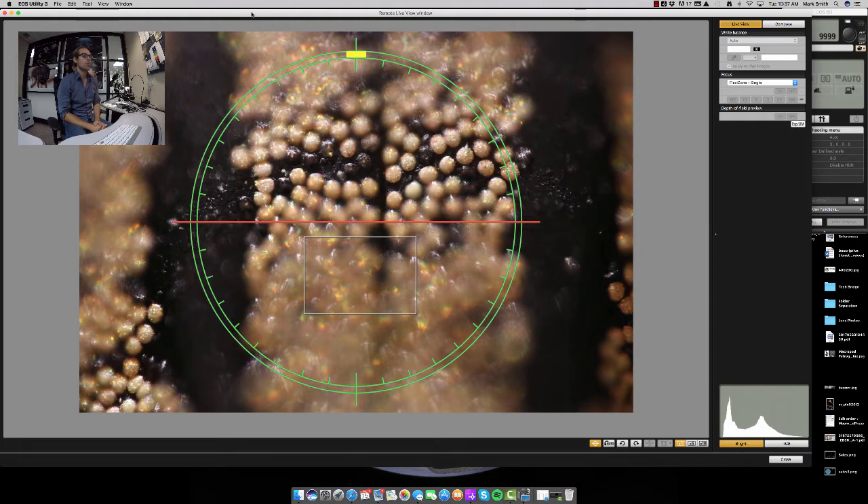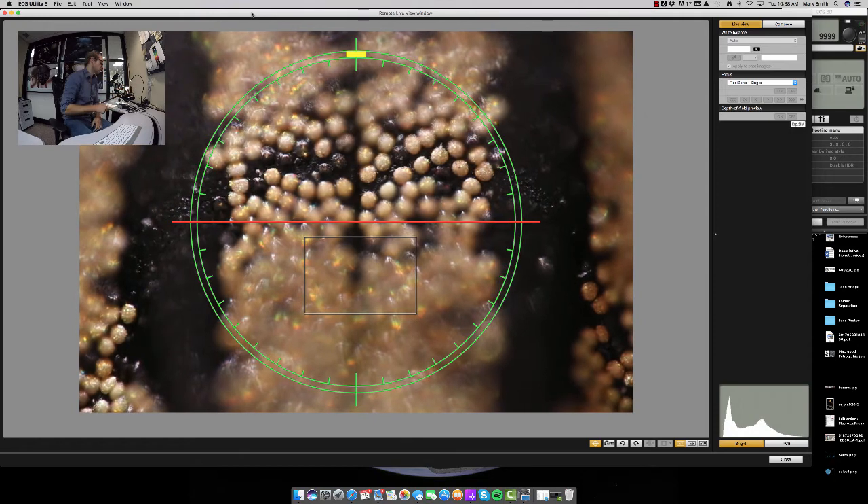In this example, we're only looking at a smaller section — we're not looking further down the body. So typically, if I were imaging the wing of a butterfly and I was using 20x as opposed to 10x, the depth isn't going to change all that much, so I would take twice as many photographs using the 20x objective. Typically, because this was an extra long specimen, 135 images was appropriate with the 10x, but normally I would take somewhere close to 85 images. So now that we're using a 20x objective, we're looking twice as close, but the field of view is only half of that. We're going to shoot around 150 images, which is a pretty good number when using the 20x objective at all times.